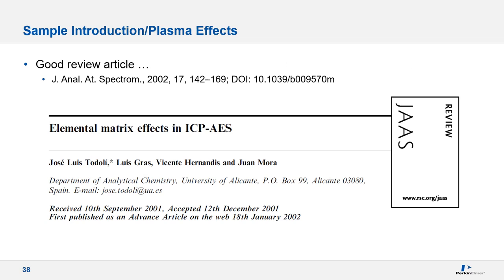Before we go to questions, I'd like to include a reference that is very useful and summarizes more than 50 years of research into matrix effects in ICP, and we are still learning about them.